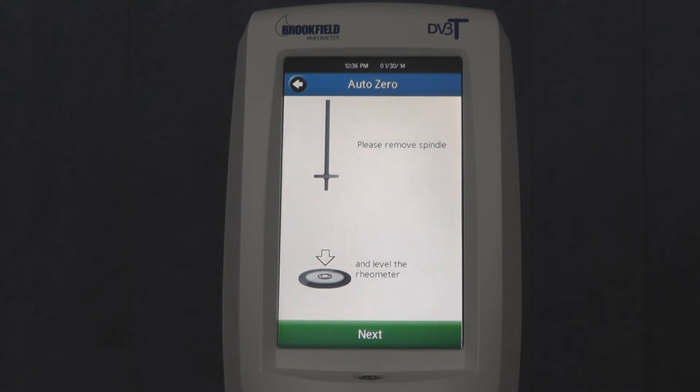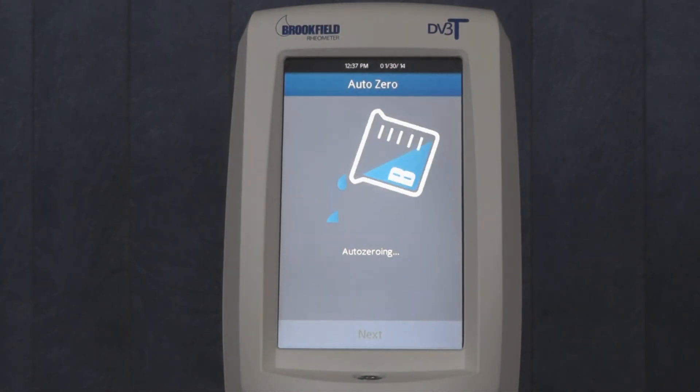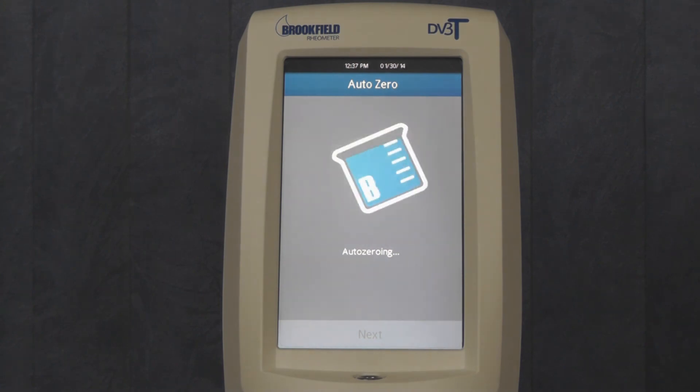You then want to test the rheometer to ensure that the screen protector was applied properly. If done properly, the DV3T will respond when you press the touch screen. If the DV3T does not respond to touch, then remove the screen protector and reapply.